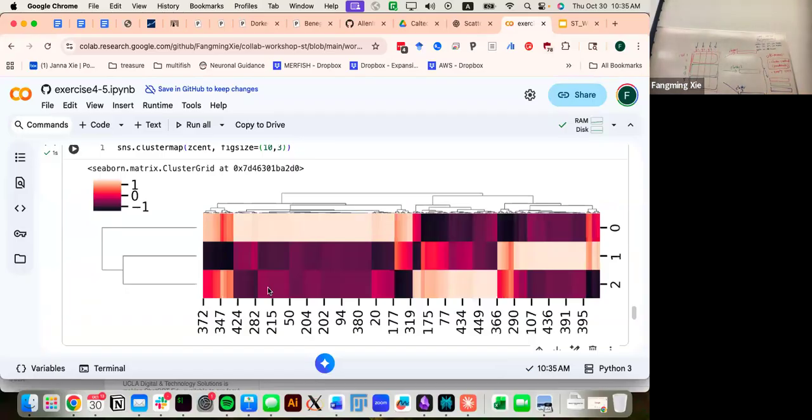Now you see it makes a big difference, right? Now what it shows is you see 3 clusters, each has a set of genes being specifically expressed in that cluster. A group of genes for 0, for 1, for 2. Because I only showed 3, it's obviously under-splitting.